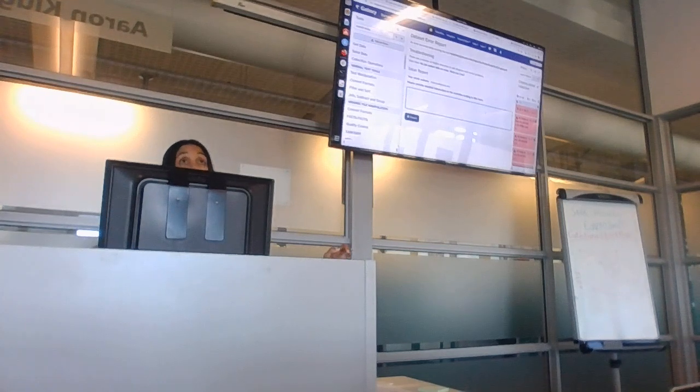I would advise you to read when you select the tool. Like I said, if you select the tool, you can scroll to the bottom. It's slow now, but you can scroll to the bottom. Is anybody else having internet issues?